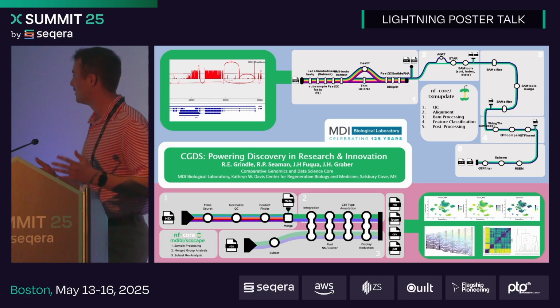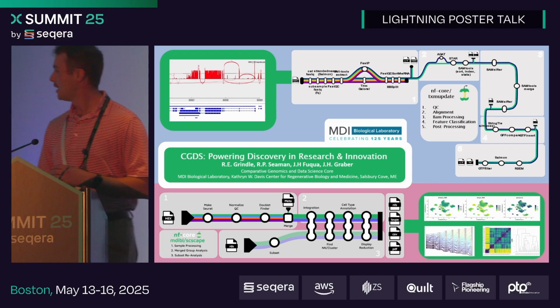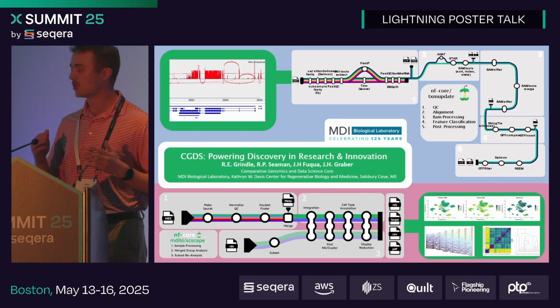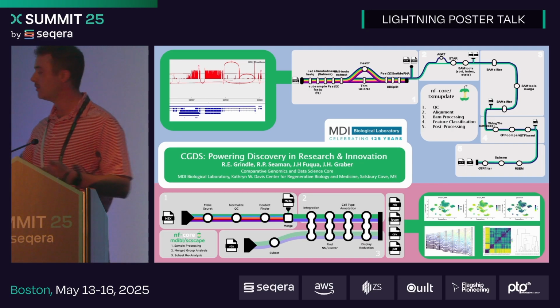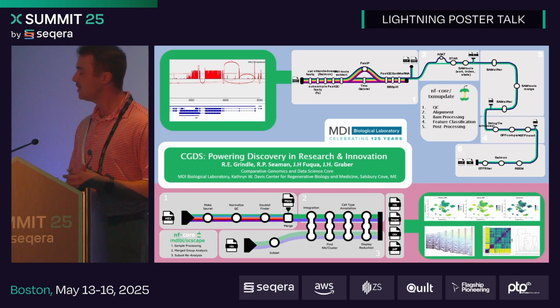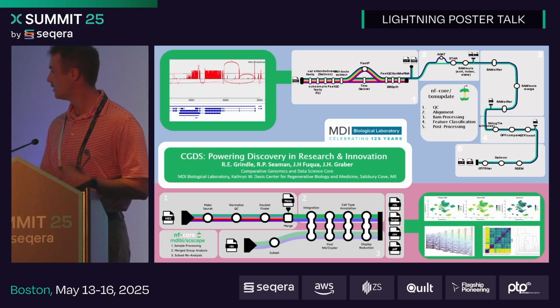And now that we've got more accurate definition, we also handle a lot of single-cell data at MDIBL. And so we've designed a pipeline to wrap around what I'm sure most of you are familiar with, some of the core processing components of a single-cell experiment, which are QC, normalization, principal component analysis, clustering, dimensional reduction, et cetera. And we call that pipeline SCScape, which really just allows us as bioinformaticians to streamline the initial data processing and ask much more complex questions much more efficiently.